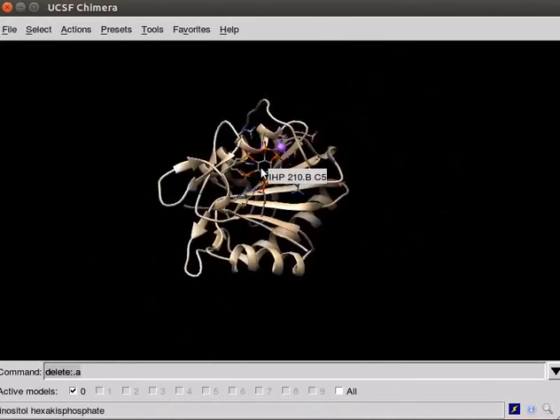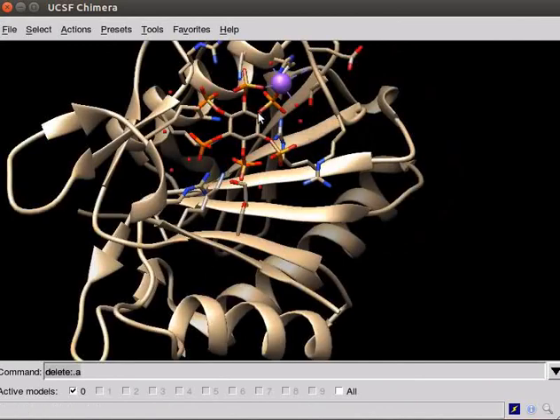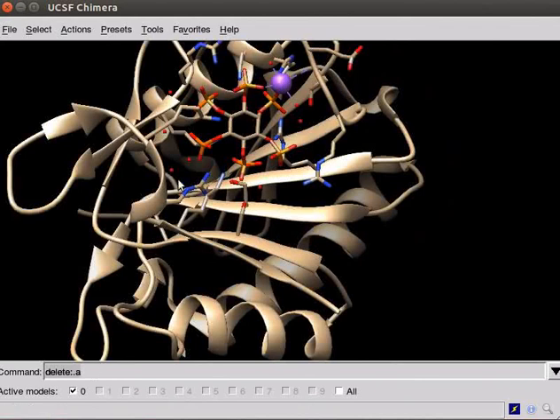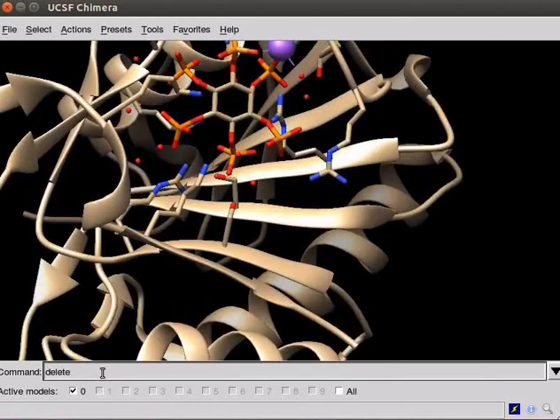Protease domain is bound to ligand, inositol hexakis phosphate, in short, IHP and sodium ion. Next, delete the solvent molecules present as red dots near the ligand. Type delete space solvent. Press enter.